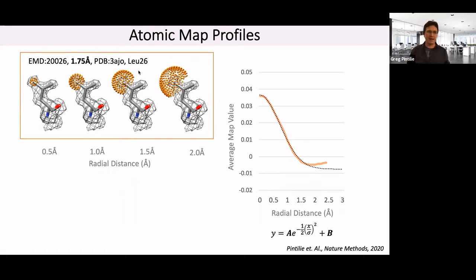Of course, it's not doing that completely, because the density values at these points might be influenced by other atoms as well. But again, this is still an attempt to isolate out the effect on the density of that particular atom.